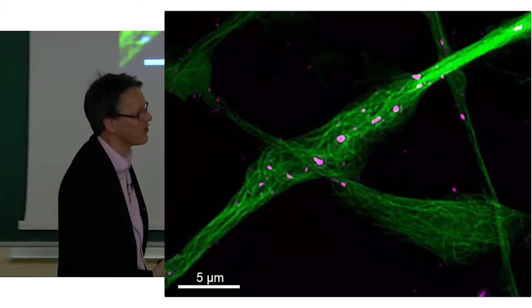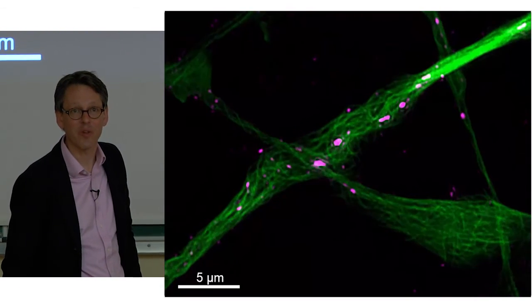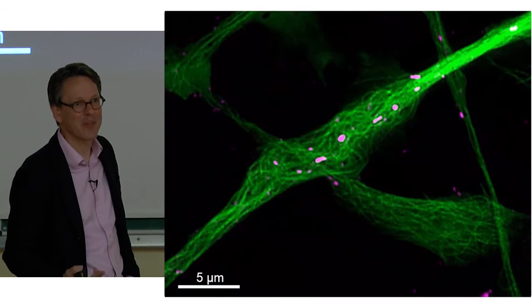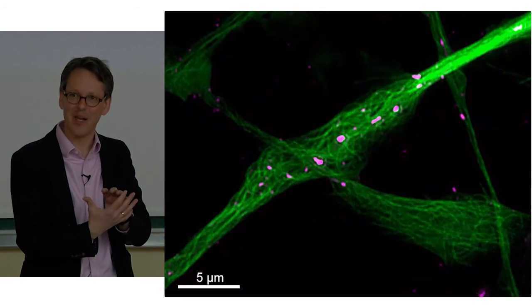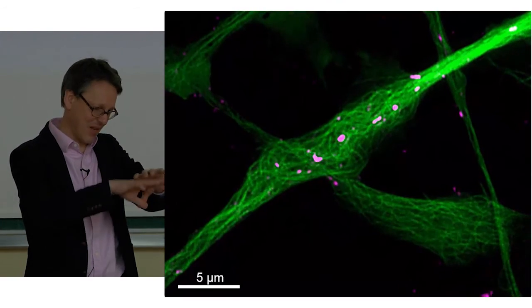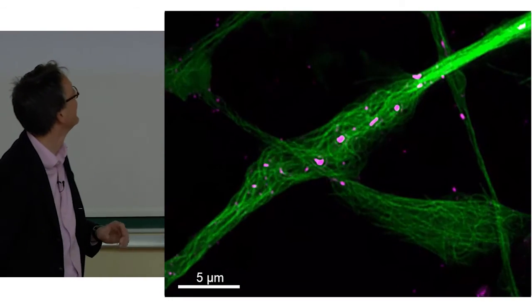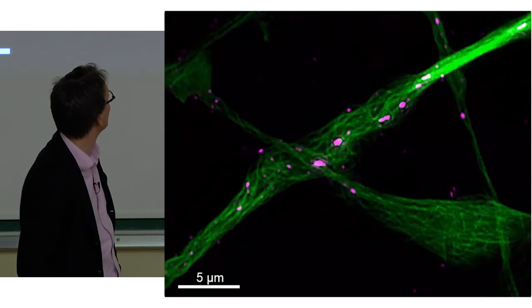So these are things that, just about 2 or 3 years ago, you couldn't have seen with other techniques. So there are very interesting questions about this, right? Because it seems that all these lysosomes are then accumulated at certain domains inside the cell. Then the whole cluster of aggregates gets packaged with the lysosomal membrane. And then actually you get problems because the cell can't deal with it anymore.